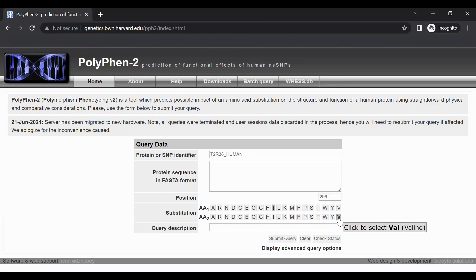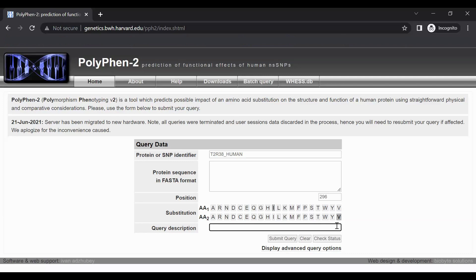Below the substitution section is a text box labeled query description. This section allows you to enter a description that will help you to remember the contents of this submission. For this example, you might type TAS2R38 variant.